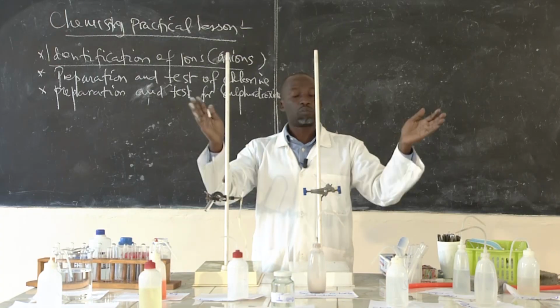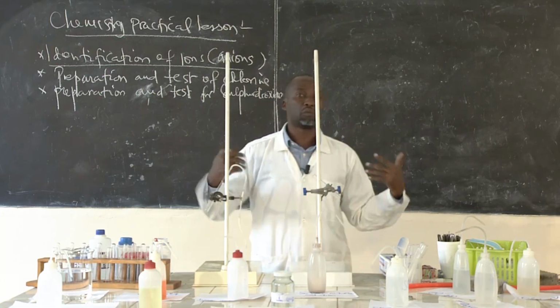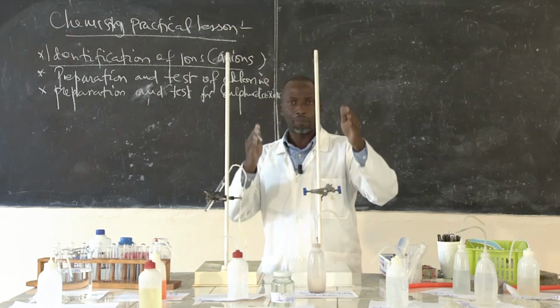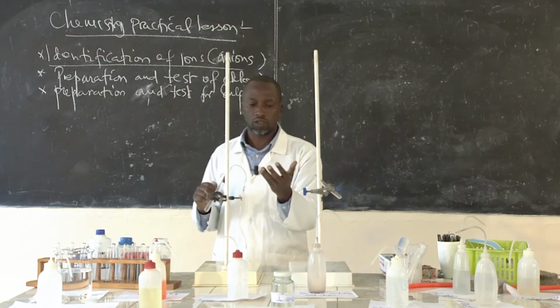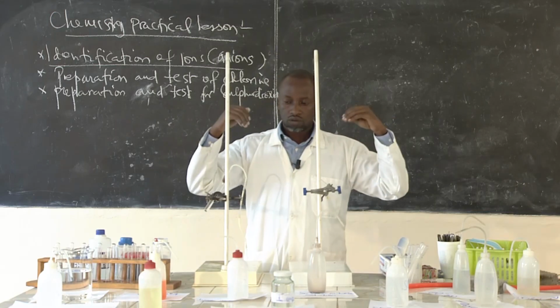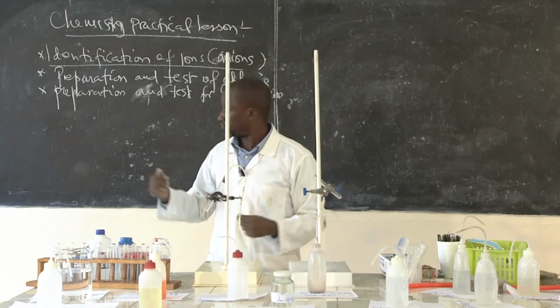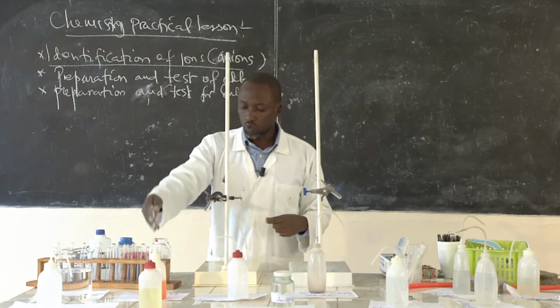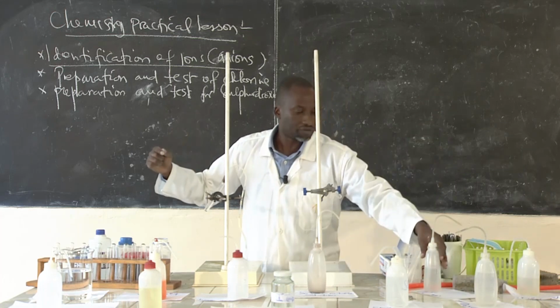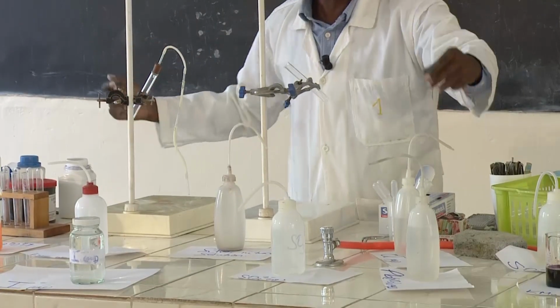But we don't keep the gases in the laboratory, for your information. So don't expect me to come with the gases here. I will prepare them at the same time. The purpose is the preparation and testing of the gases. And then we'll have to test some other anions as well, because we have a number of them. We have chloride ions. We have the sulfite ions. Those are solutions containing those anions.